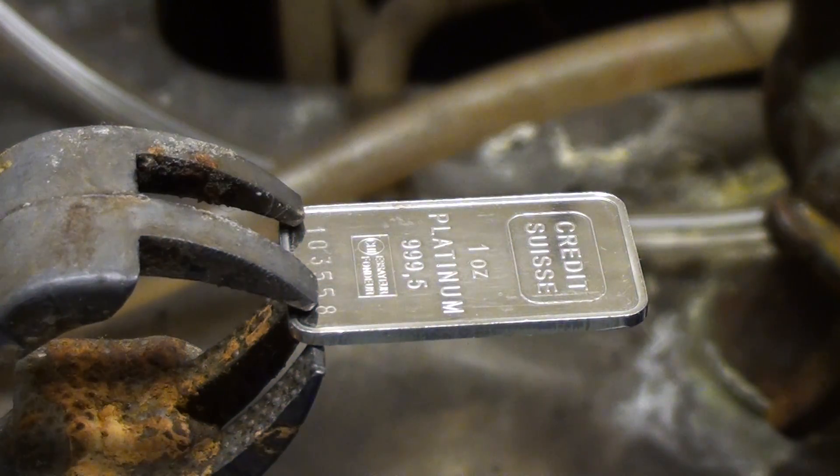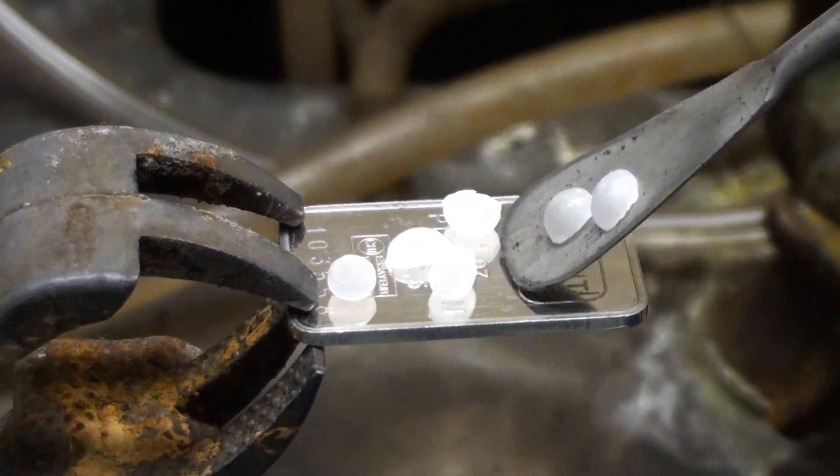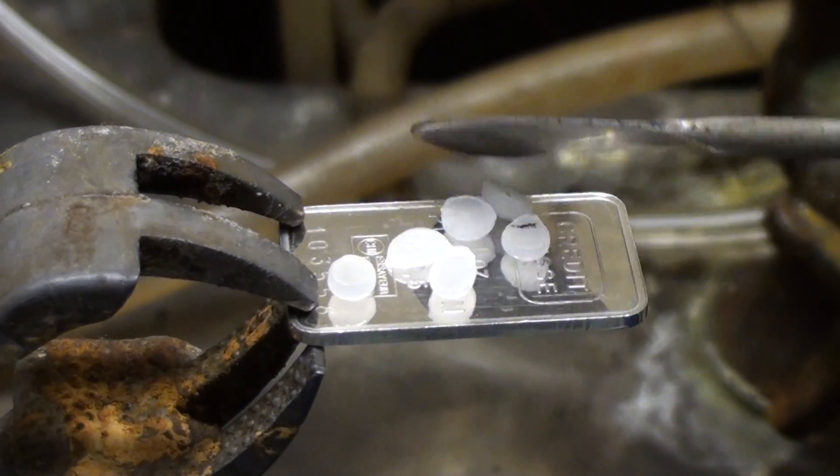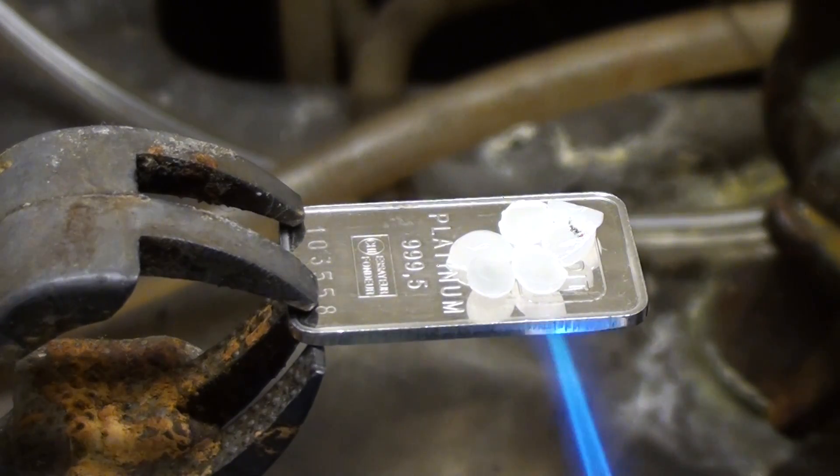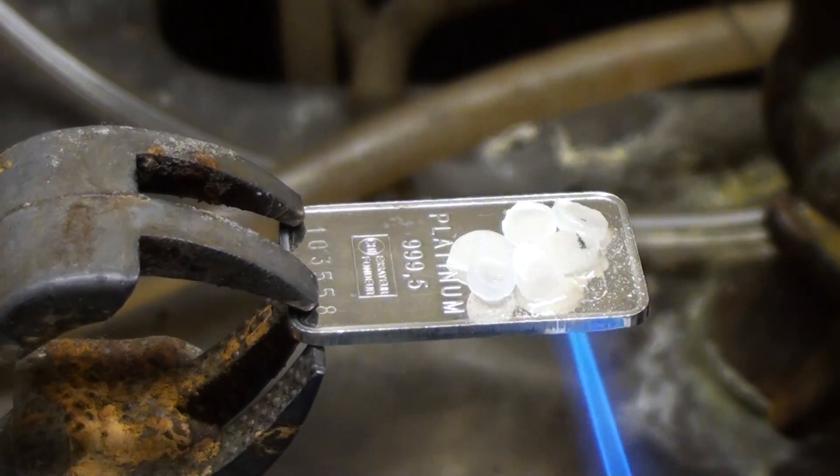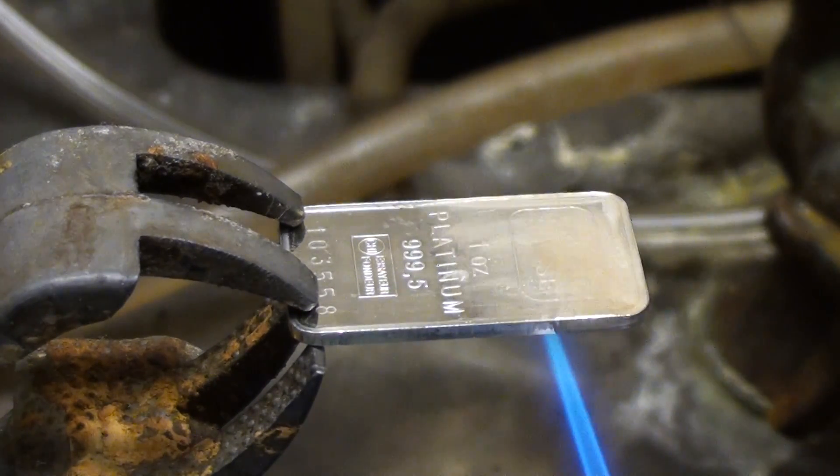Now for the reaction with molten sodium hydroxide. I'm putting these pellets on the surface and now I'm going to heat it with a torch. The sodium hydroxide is melting and as I continue heating it, oh look, it's turning brown.